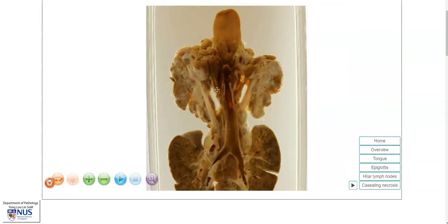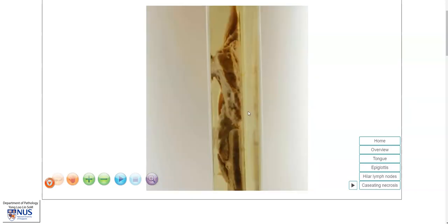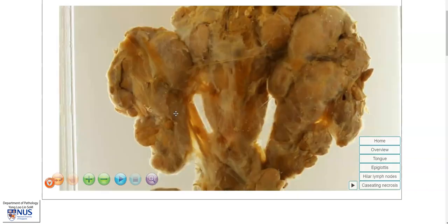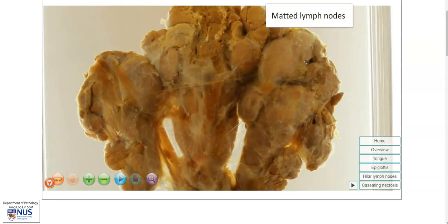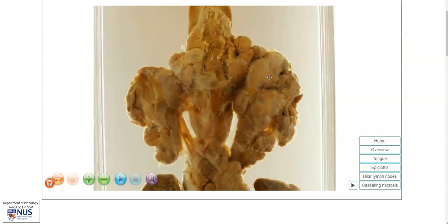Moving on to the cervical lymph nodes, we can see that on both sides the nodes are very large, and they are stuck together, and this is better appreciated on the opposite surface. These lymph nodes appear to be stuck to each other, and for this we use the term matted. So we have matted, enlarged lymph nodes. Most of the time, the differential diagnosis for enlarged matted lymph nodes would include TB versus malignancy, and the malignancy can be a primary nodal malignancy or metastatic malignancy in the lymph nodes.